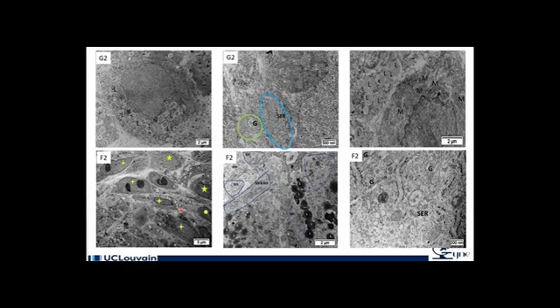Ultrastructure analysis from F2 cells revealed the floating structures contain 3 different cell types. Fibroblast-like cells with elongated nuclei, marked with a circle here, and transitional cells, which are ellipsoidal in shape with an oval nucleus, and here they are marked with a 4-tailed star. And theca-like cells, which have the same ultrastructure as described for attached cells in G2 with undulated nuclei, and they are marked with a 5-tailed star.